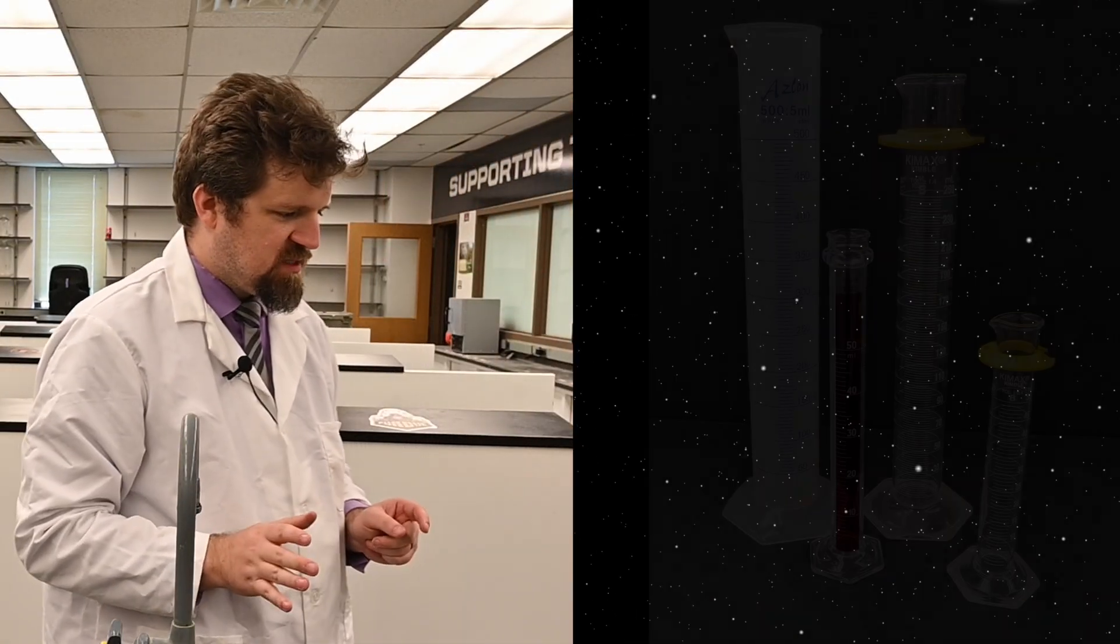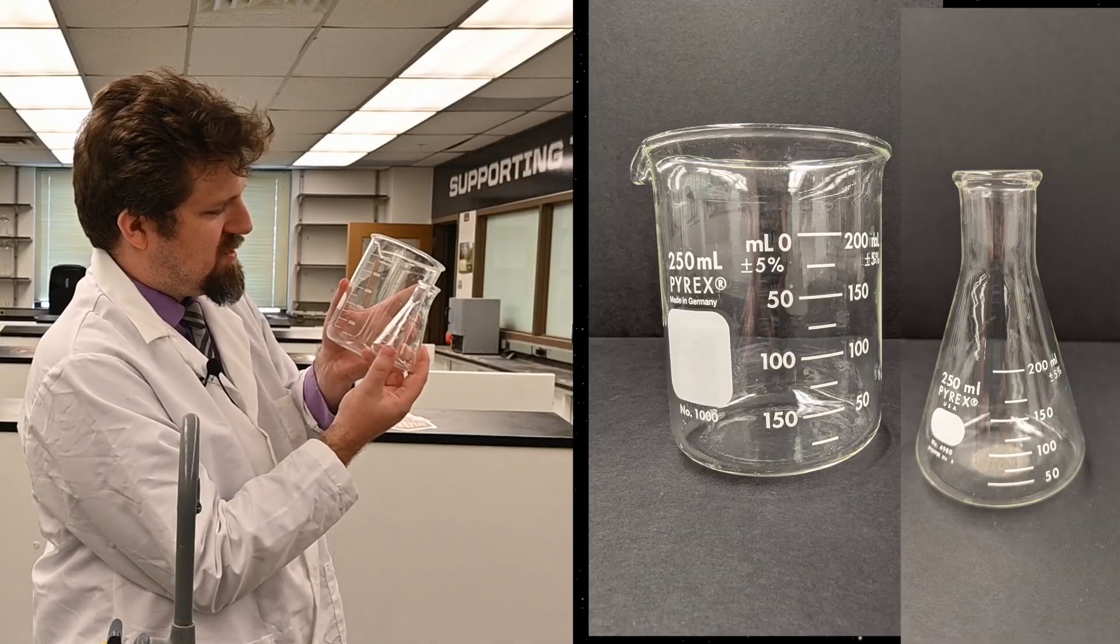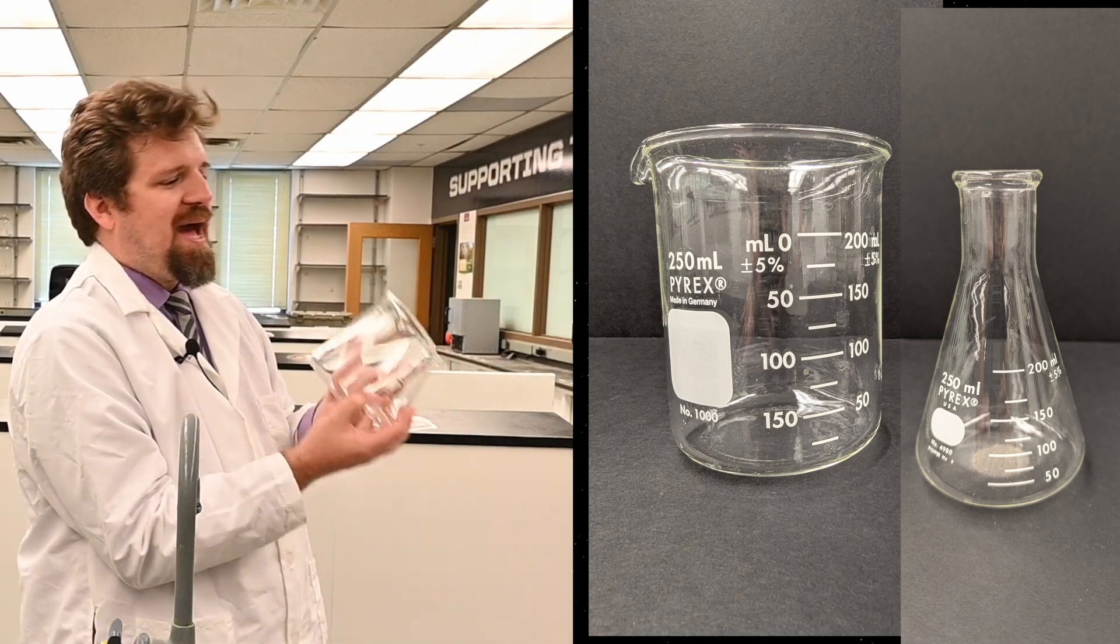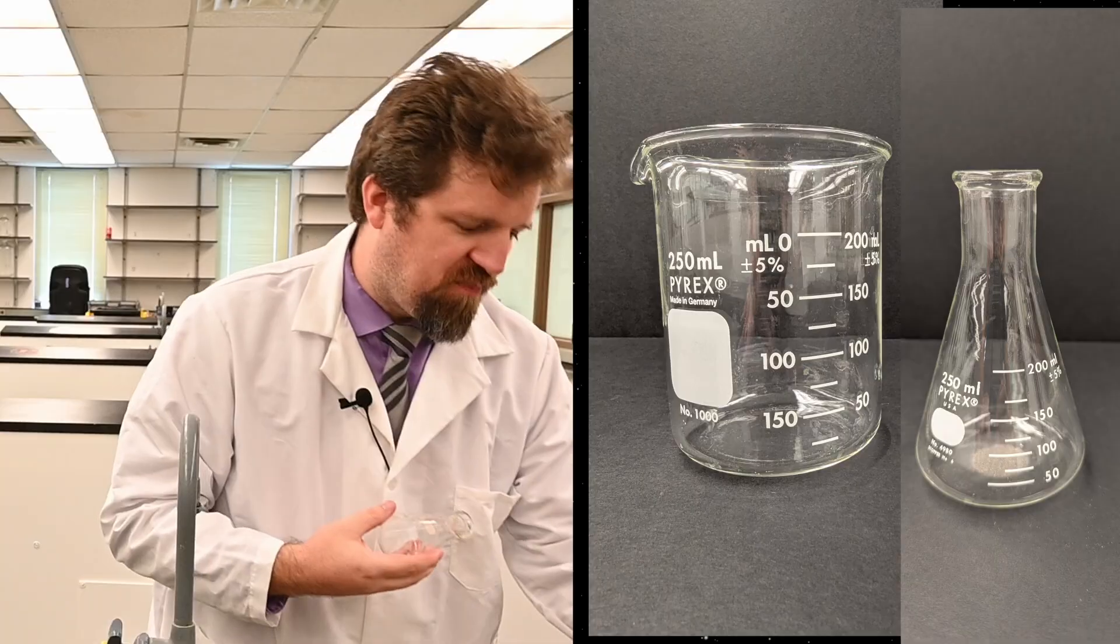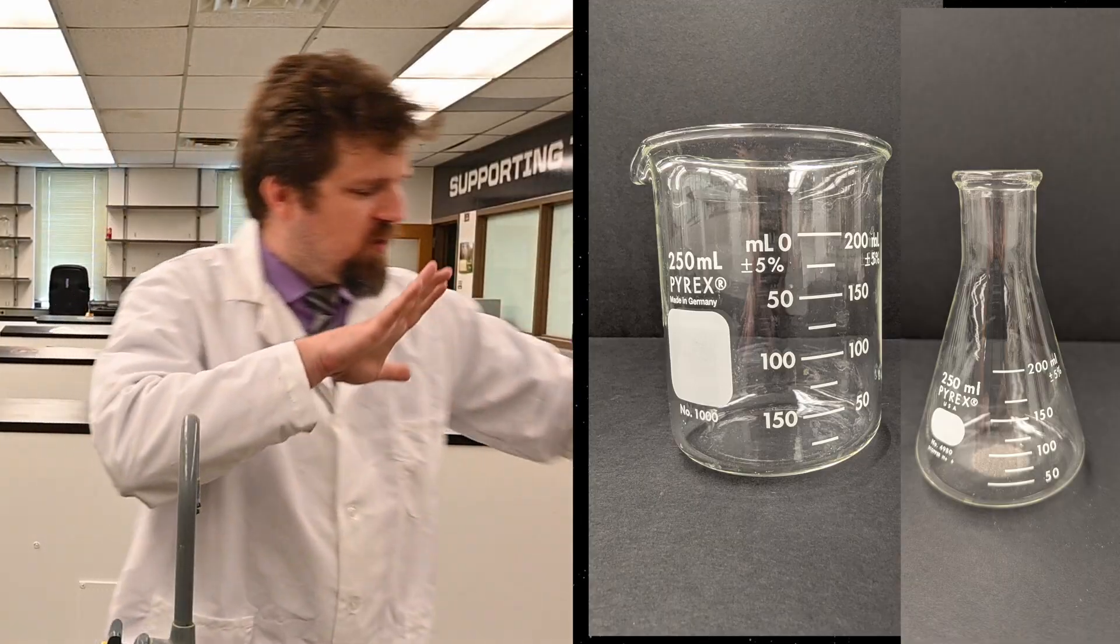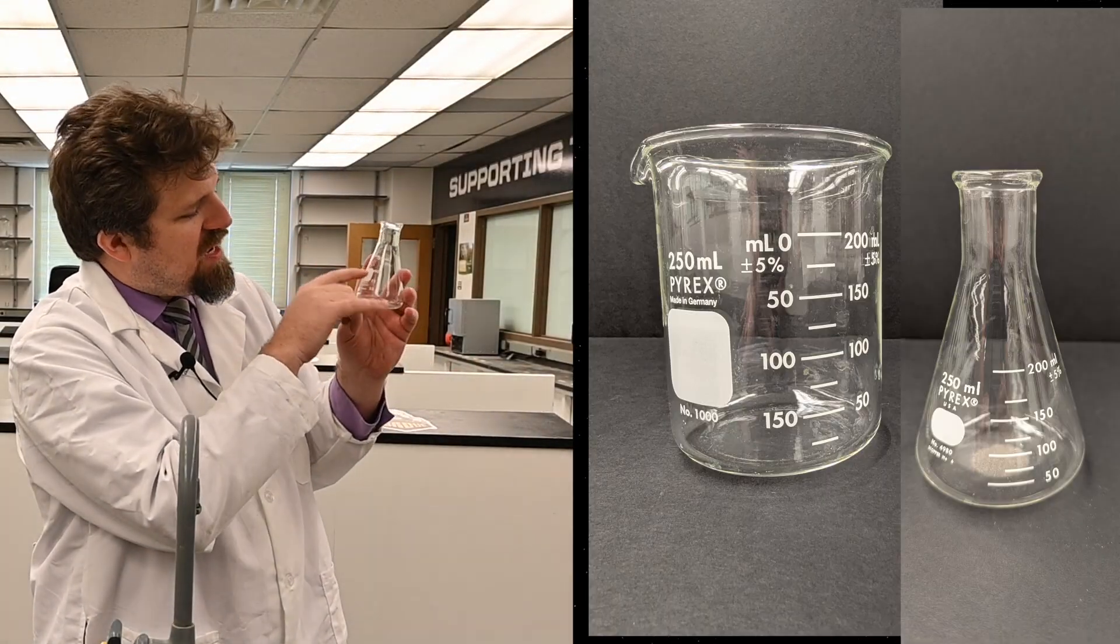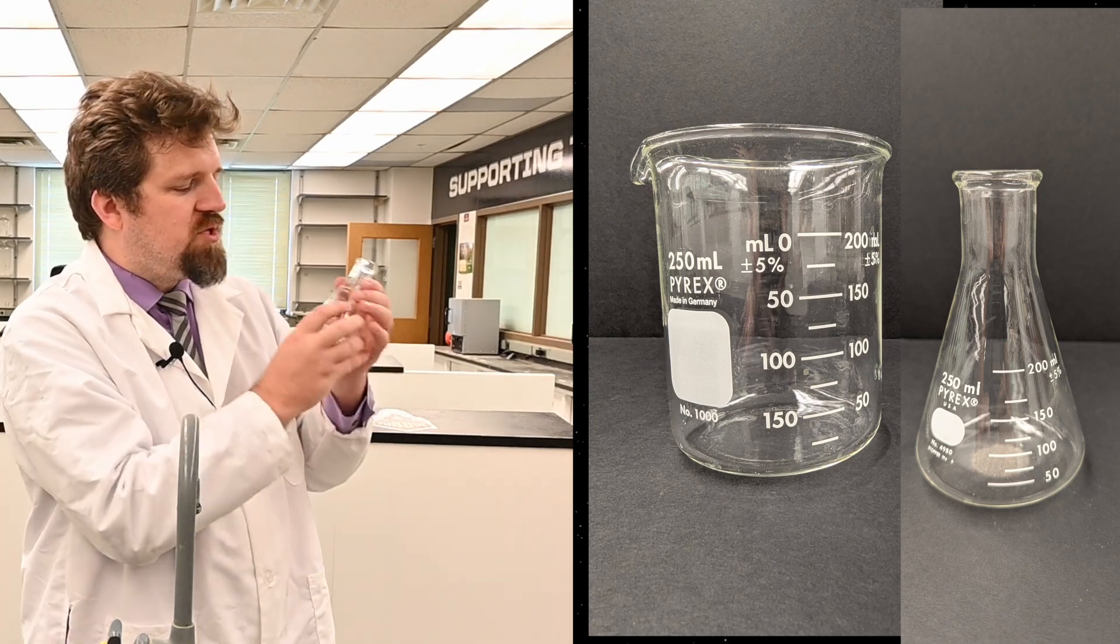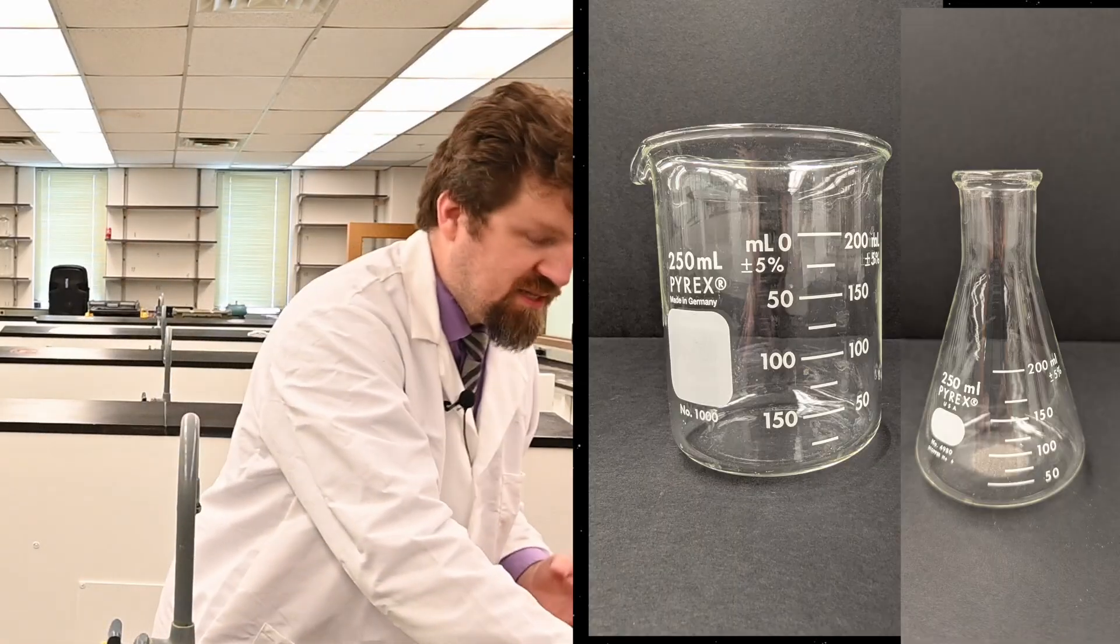Some of you keen-eyed observers might have noticed that the flask and the beaker also have lines on it, so why can't we just use these to measure? Please don't. Please do not. These are not that precise. If you measure, if you put water up to that line, say that's 50 mils, it's going to be pretty close, but it's not going to be anywhere near as precise as this 50 right here. The reason they put the marks on is that you can have an estimate. Do not use these as super, super precise, because they are not. You want to use a graduated cylinder for something like that.